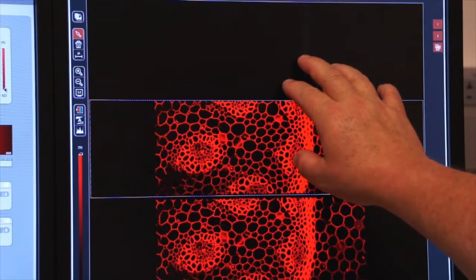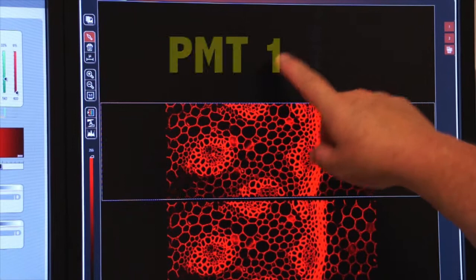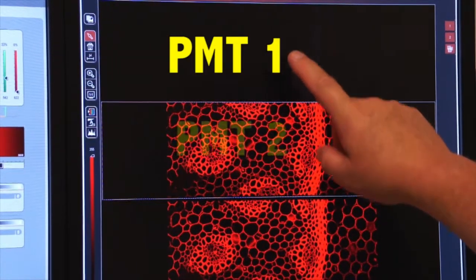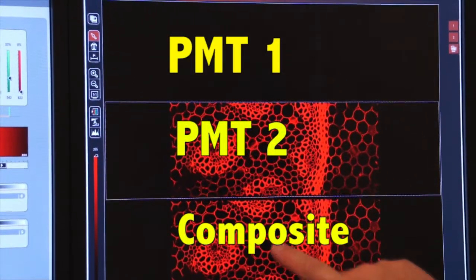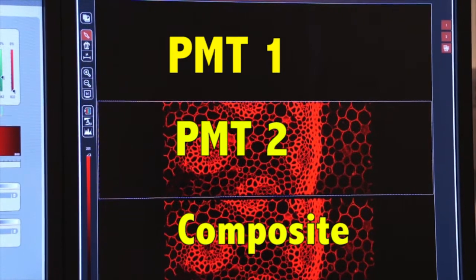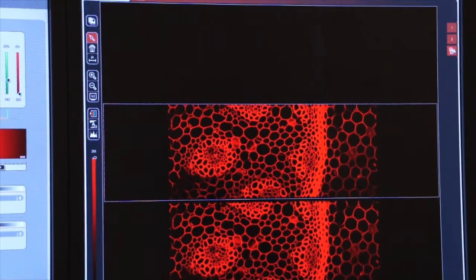I have two PMTs engaged, so the top window is PMT1, this is PMT2, and that's the composite. Let's turn off the composite image for a second, so you see two windows.